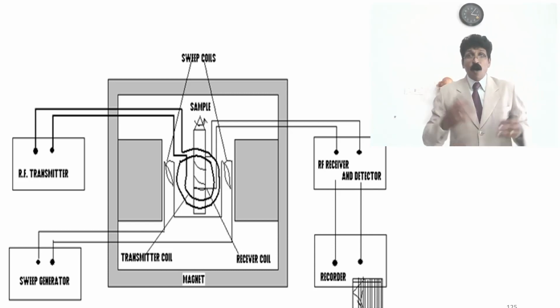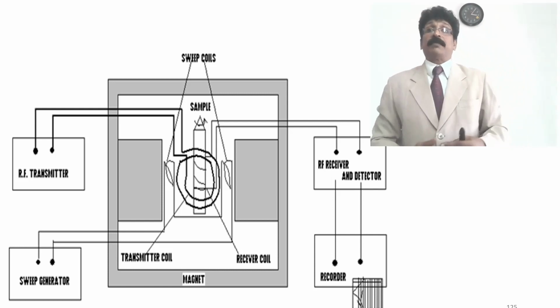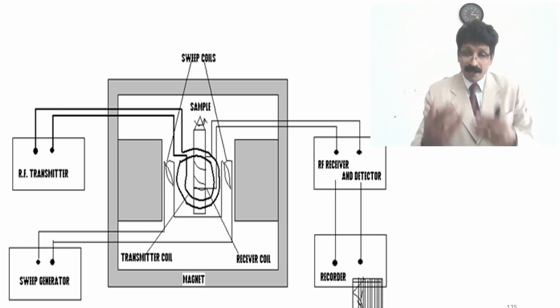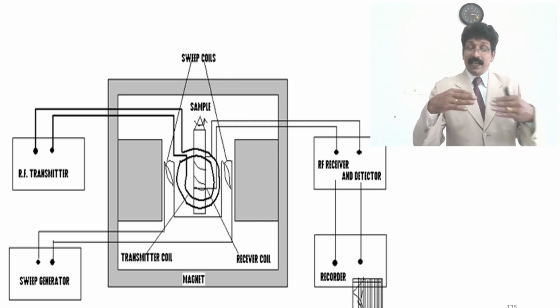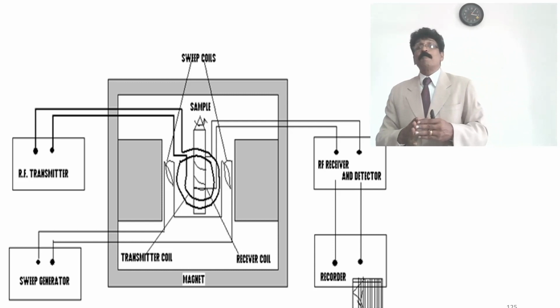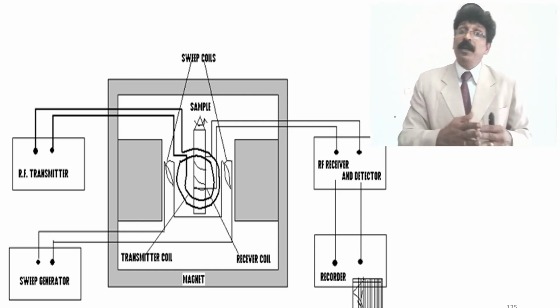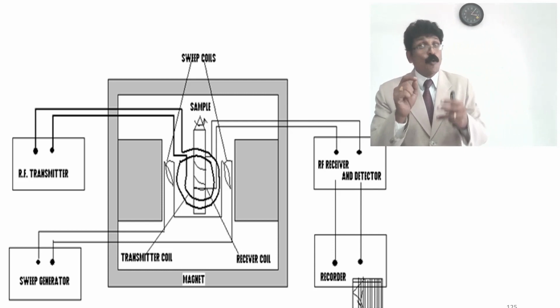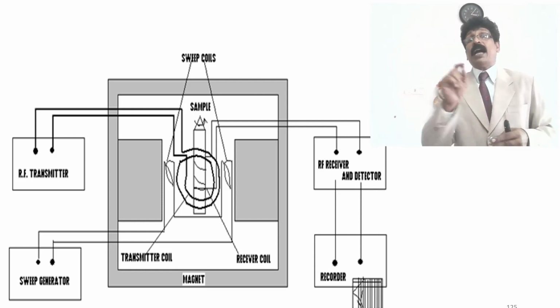Now we will talk about what type of spectrum. Like we have seen, the graphs are very different for mass spectrometry, and also for the UV spectrophotometer. So here also we should know what type of graphical appearance there will be and how to calculate and find out.